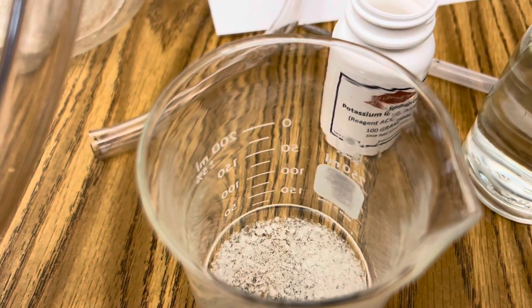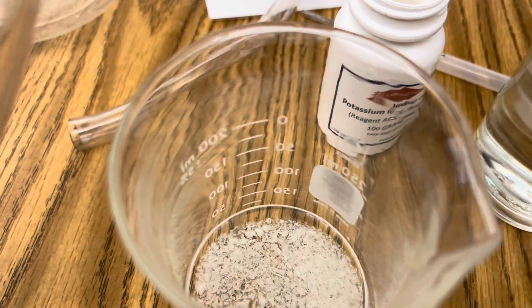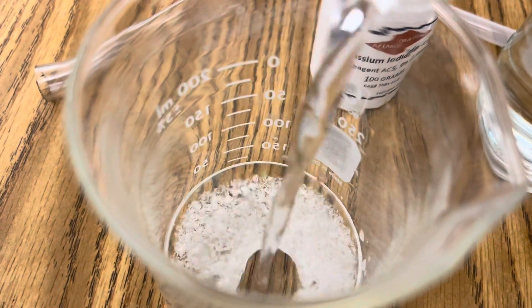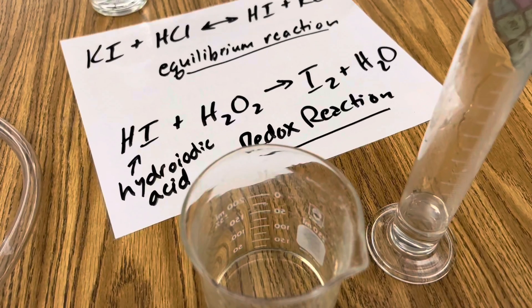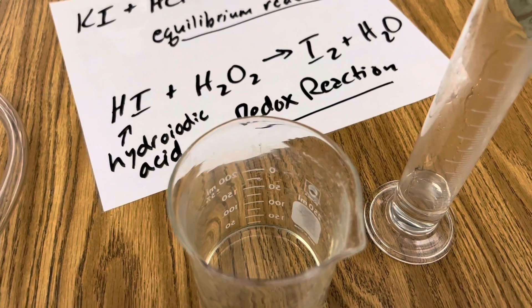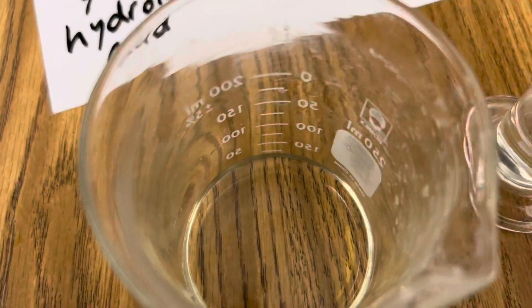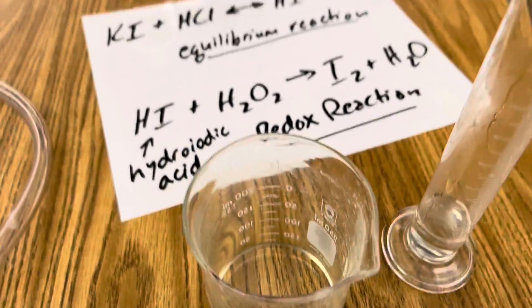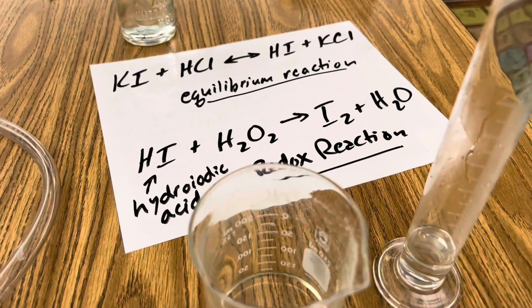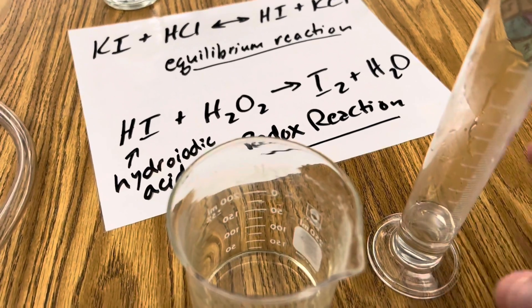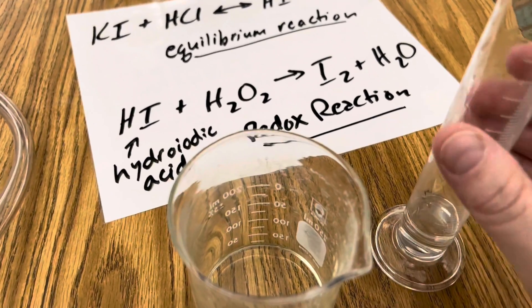The first step in this reaction is to add your distilled water to your potassium iodide. Once you can see that the potassium iodide is dissolved in your water, you're ready to add your 10 mils of hydrochloric acid.